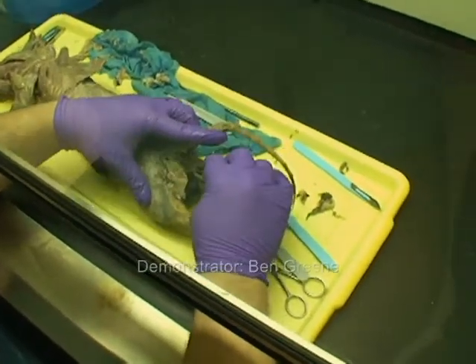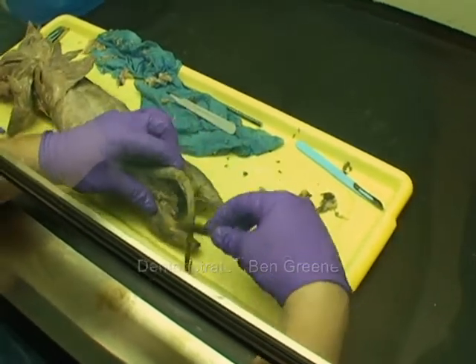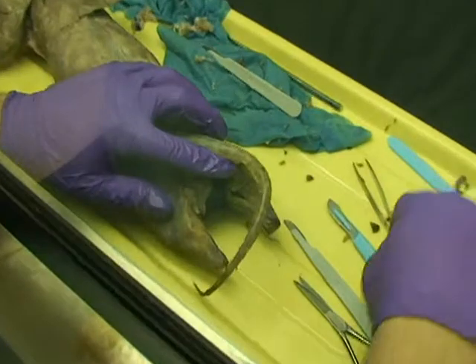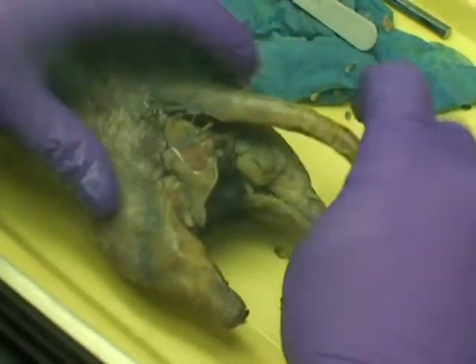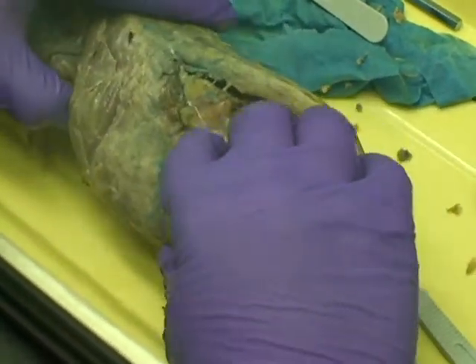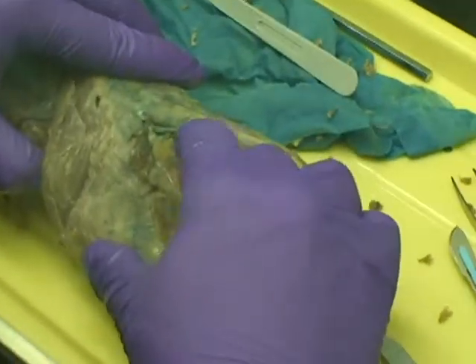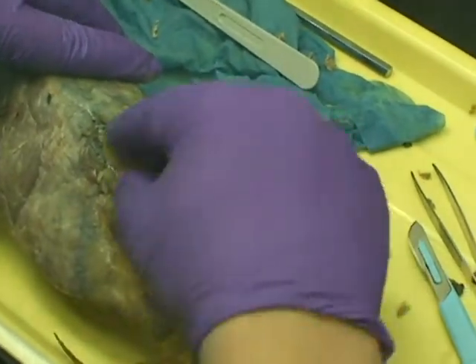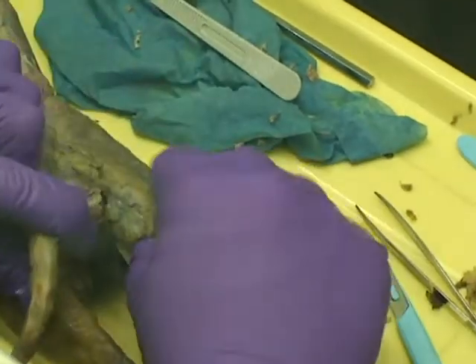We have a large male mink here. We have the anal glands right below the tail, right above the anus, and there's one on the other side.